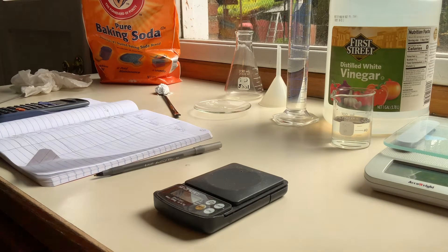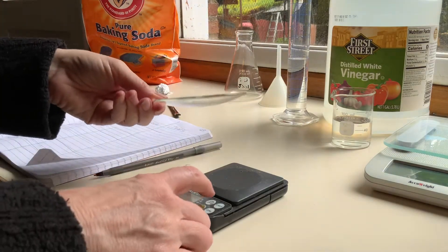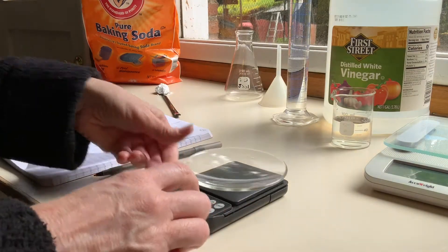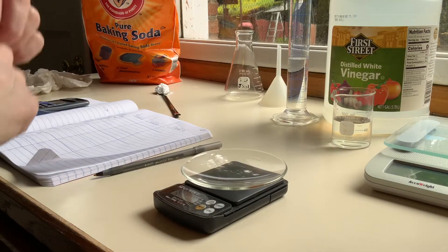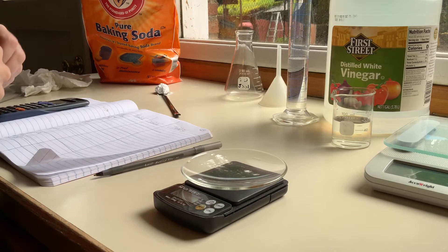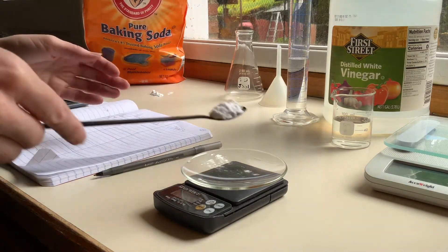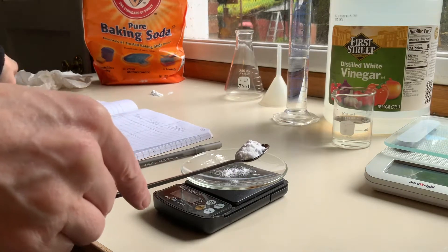I am going to do trials two and three in the stoichiometry part A reaction. I'm going to tare my watch glass, set this to zero, put it on there, and then tare it. I'll let that read zero and then I'm going to add some baking soda — just 2.3 grams or so.